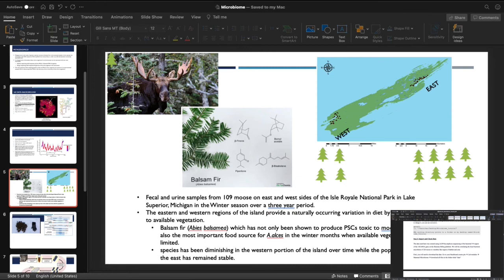You're going to go to your Blackboard course site, go to Lab Modules, Mammal Microbiome, download all of the files in the folder titled Data. And just like you did last week, you're going to want to put those in a labeled folder. Whatever you want to name that folder, you want them all to be in the same place because we need to set our working directory for RStudio.